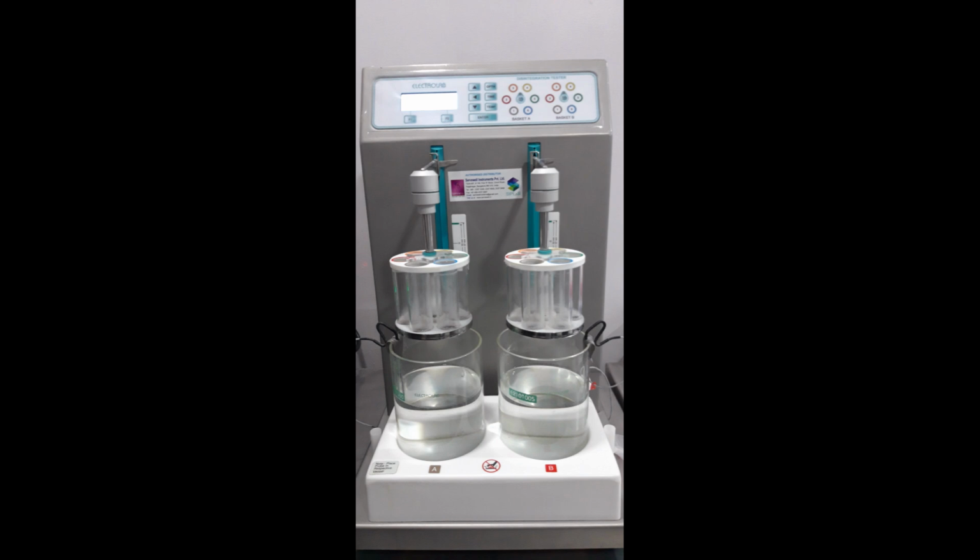4. Practical uses and regulatory importance. Quality control: batch-to-batch consistency ensures tablets and capsules release API at the intended rate. In-process check: detects overly hard compacts or faulty coatings before coating drying. Formulation development: disintegrant screening, comparing starch, croscarmellose, sodium starch glycolate, etc. Coating optimization: ensuring enteric or sustained release coatings meet disintegration specs.